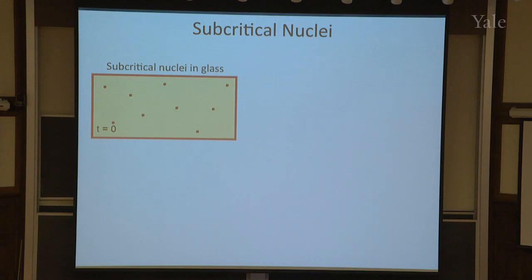So this is our theory. Our theory is that in the amorphous region, maybe you have some sort of substructure that is a little bit ordered, not really ordered, but just a little bit. So when you crystallize this much region, and then a little bit more, and a little bit more, and you're now near this substructure, suddenly the crystallization rate increases.